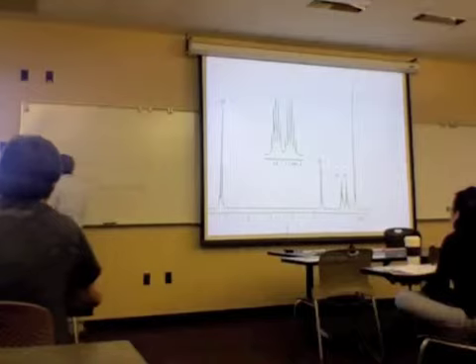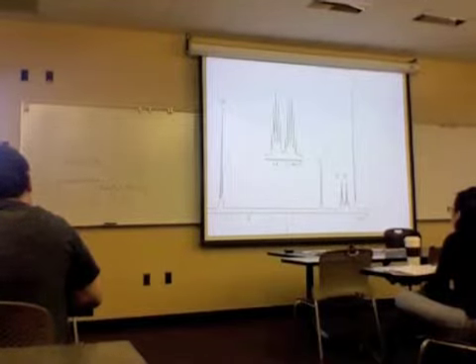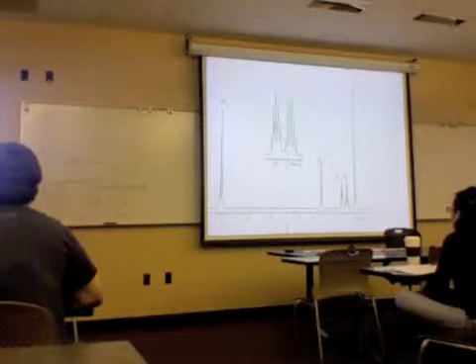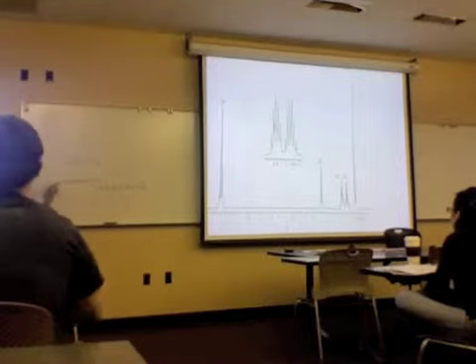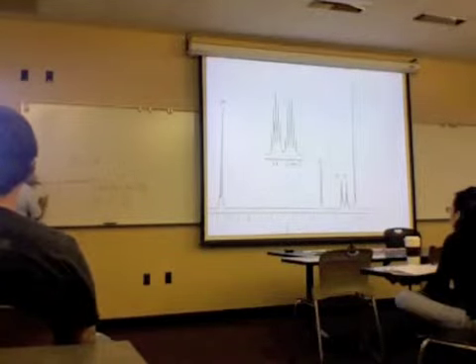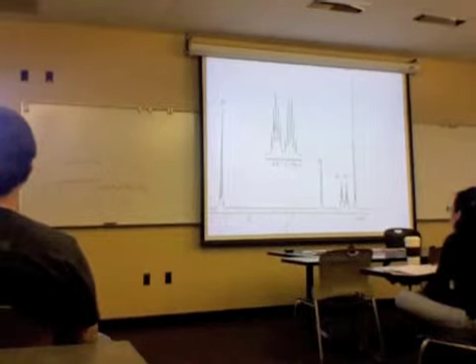Now, one last thing. Let's look at the structure we've proposed here, and let's figure out how many different kinds of carbons are present and predict what the NMR should look like. Okay? I would suggest that each one of these is different. So there's 4 in the chain. There's the kind that's attached to the ring, the kind that's next door to that, and all the way out. All 4 of them are going to be different. This will be a 5th type right here. These will be a 6th type, 7th, and then 8th. The C13 NMR spectrum ought to have 8 signals in it.